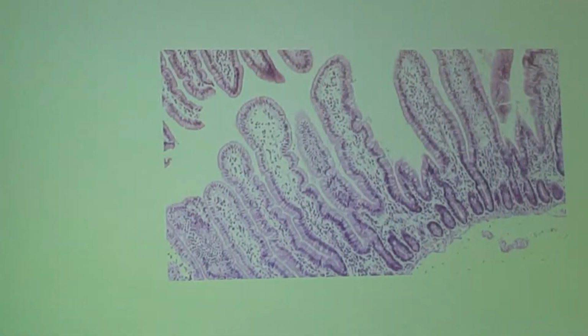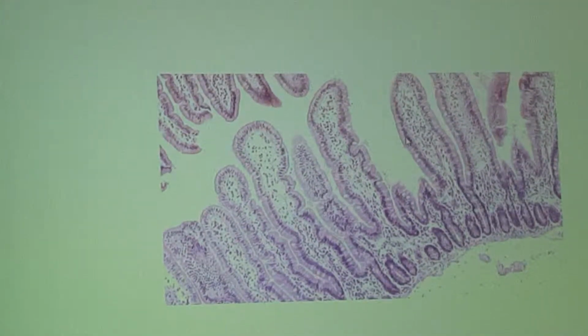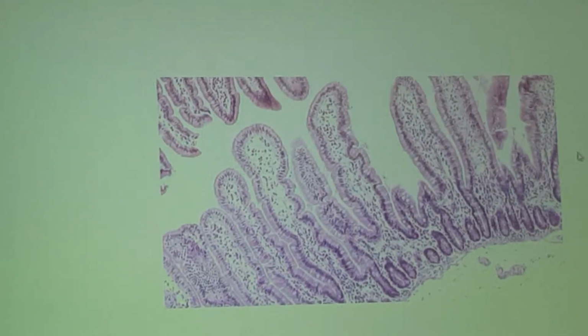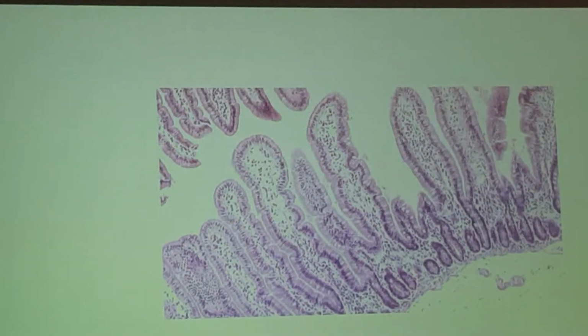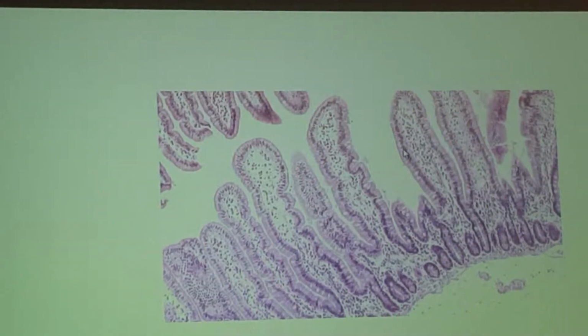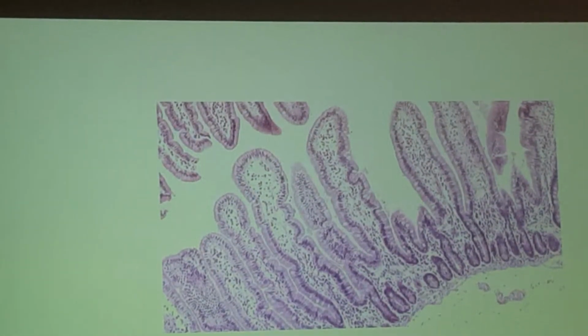We are up to number 11. Number 11, I was pointing here and said name this layer, simple columnar epithelium with microvilli. This is part of the small intestine. I'm pointing at this layer that's on the outside of the villus. This layer here, simple columnar epithelium with microvilli. Sure. If you said with goblet cells and microvilli, great. That's fine.